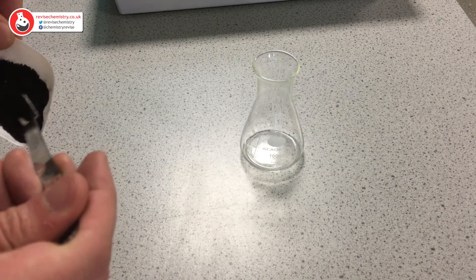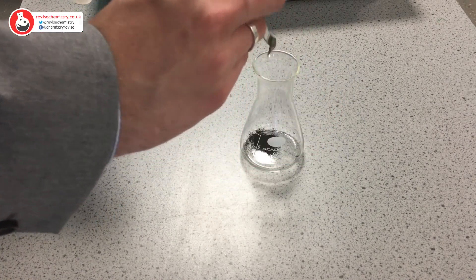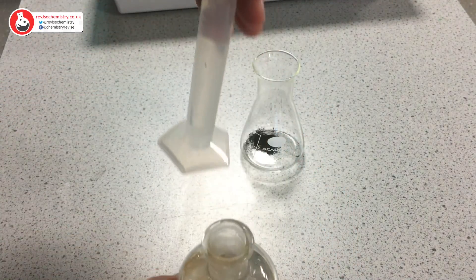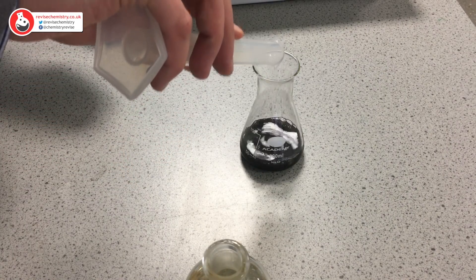All I'm going to do is take one spatula of the copper oxide and put it into the conical flask. I'm then going to add about 25 mils of acid, and we're going to need to move over to where I have a Bunsen burner set up and heat the solution.